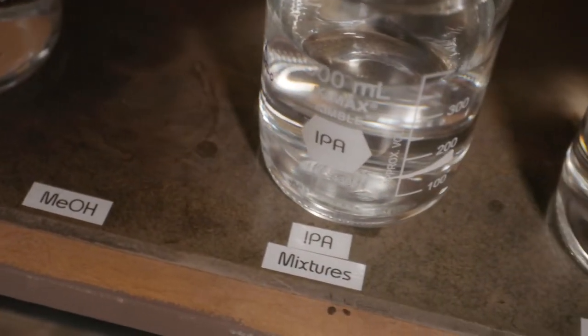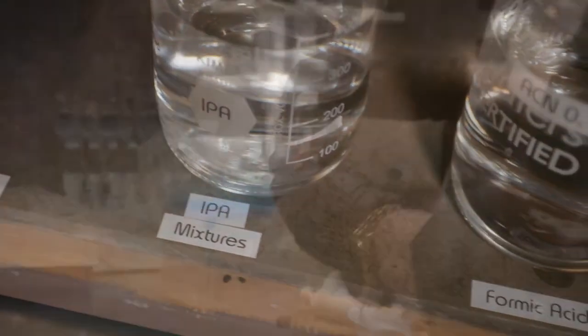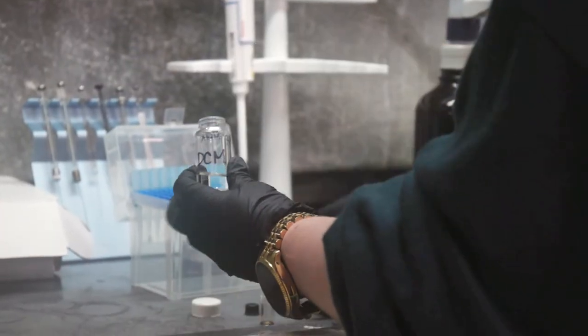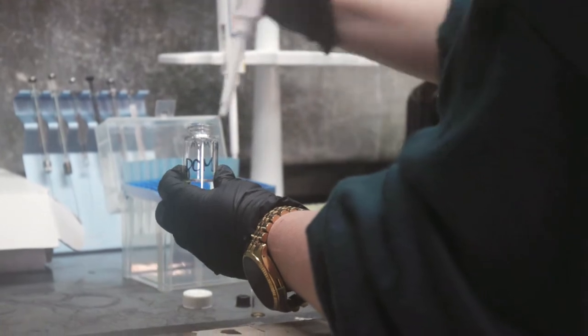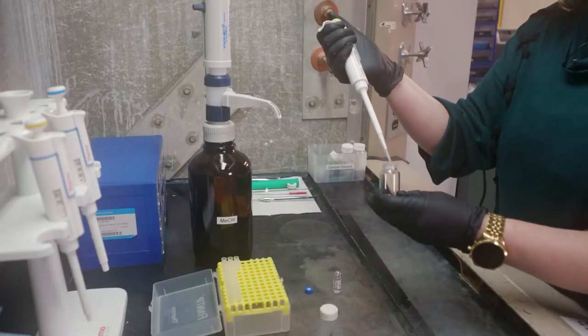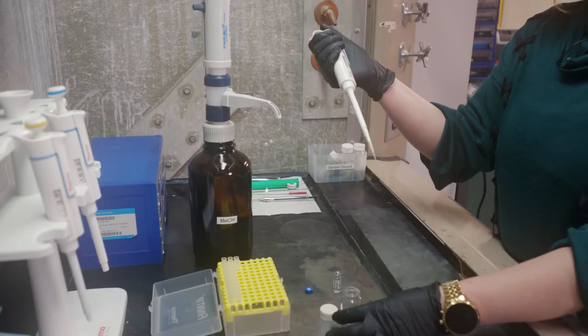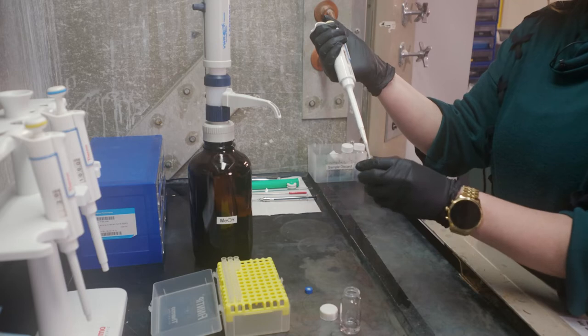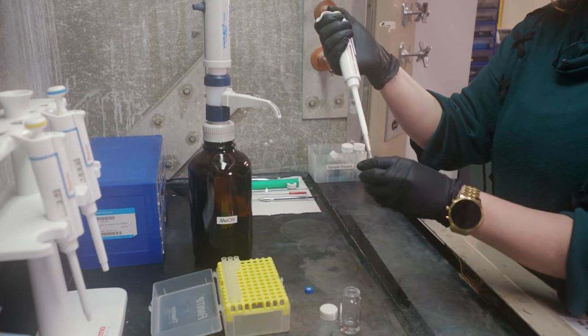If your sample is not soluble in any of these solvents, you can dissolve your sample in a compatible solvent, for example DCM, and then dilute into one of our preferred solvents, as long as they are miscible and your sample does not precipitate upon doing so.